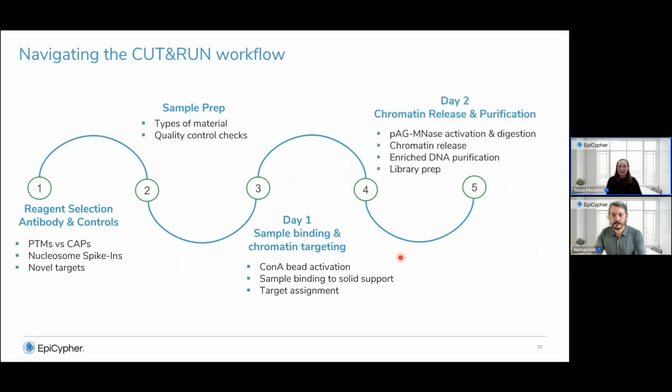We'll move into day two, which is categorized as chromatin release and purification. And we'll look at the PAG MNase activation and digestion, enriched DNA purification, and library prep. And then lastly, we'll go into the next generation sequencing and the data analysis.